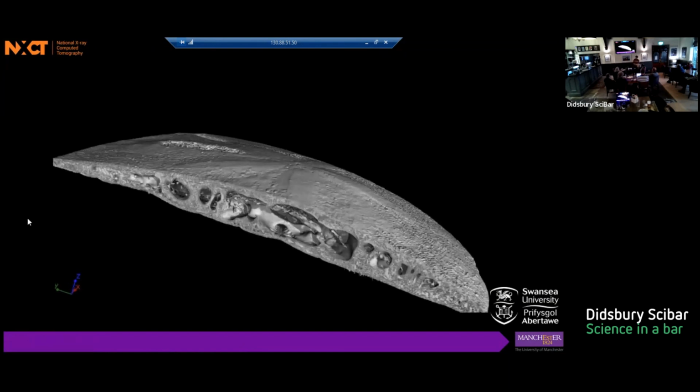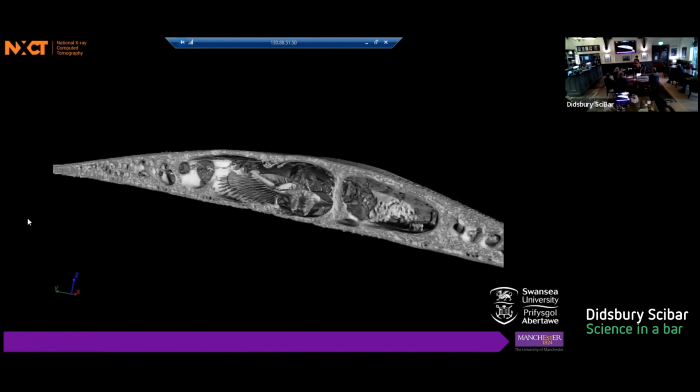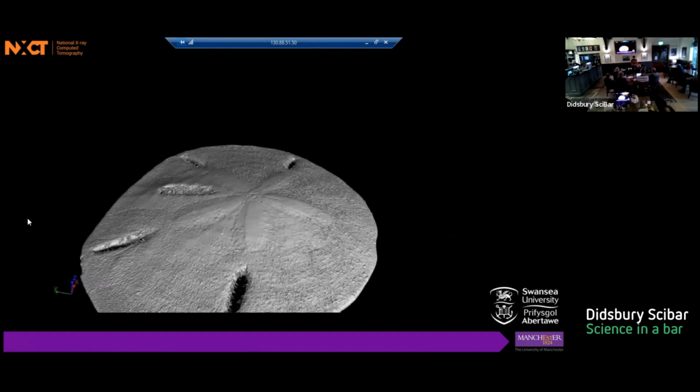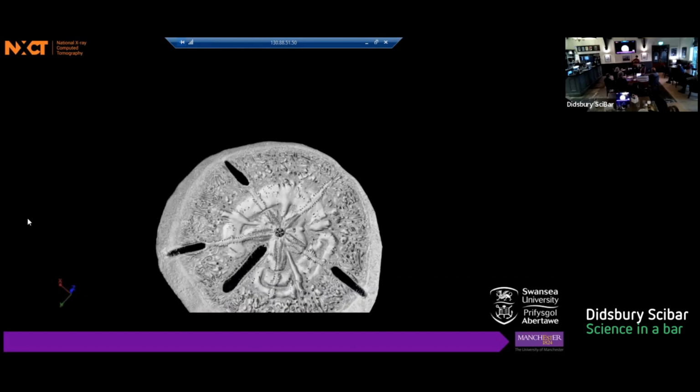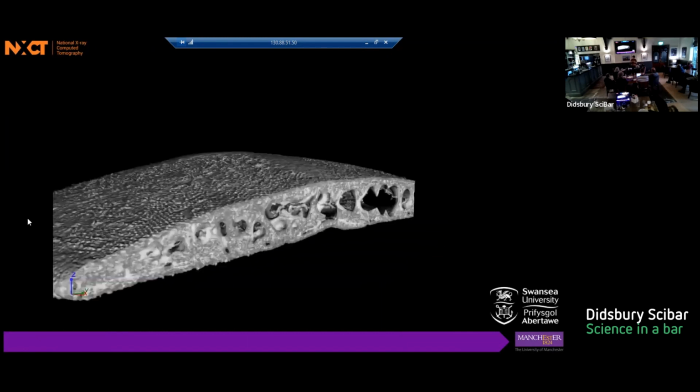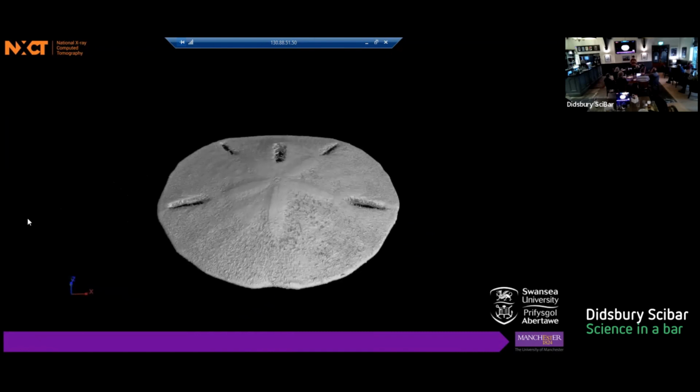So this was scanned by a colleague who was looking at nature as a form of bio-inspiration for engineering. So you could see that it had that interesting open work that sort of looked like struts and beams. And so she was interested in, well, is this sort of structure particularly useful that we can then apply it to real engineering problems? Is it just useful at the scale of a sand dollar on the beach, or can we extrapolate that out and use it for our own inventions? Because, hey, nature's had all these millions of years of evolution to come up with a good idea. Why reinvent the wheel? Let's just nick it.